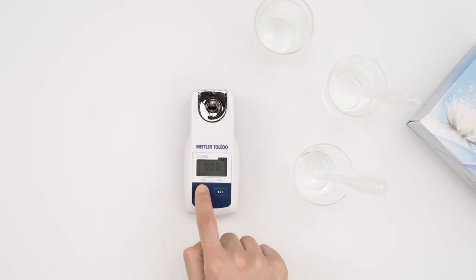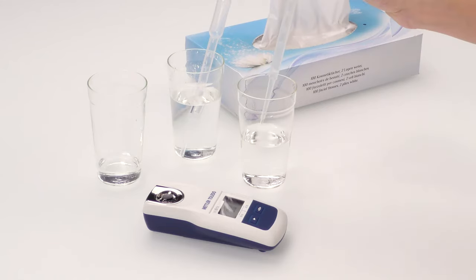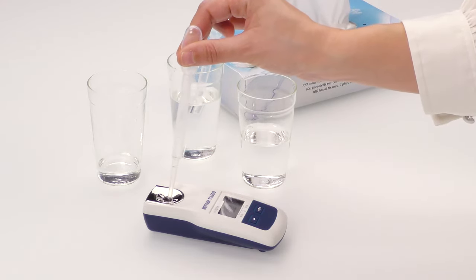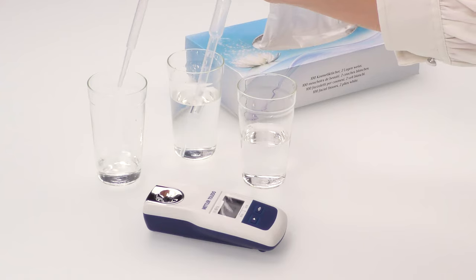Quickly verify the instrument by measuring water. Press the READ key. The result should lie within the instrument accuracy of plus or minus 0.2% Brix. Remove the water and dispose it in the waste beaker.